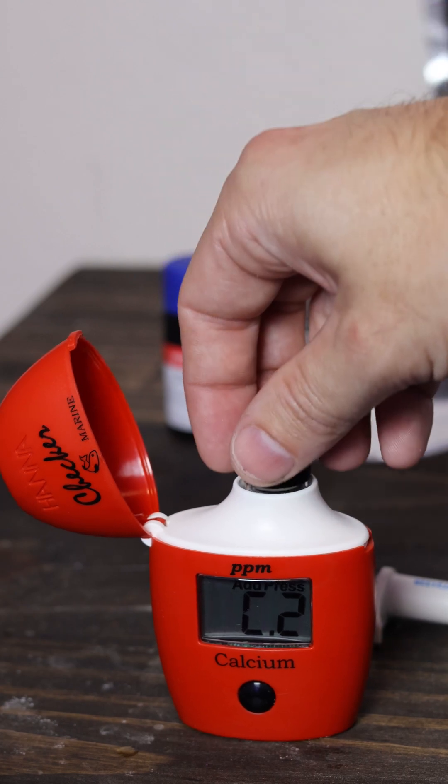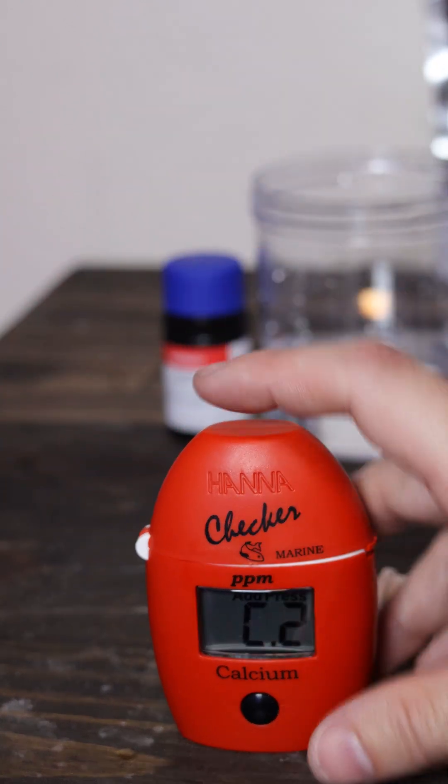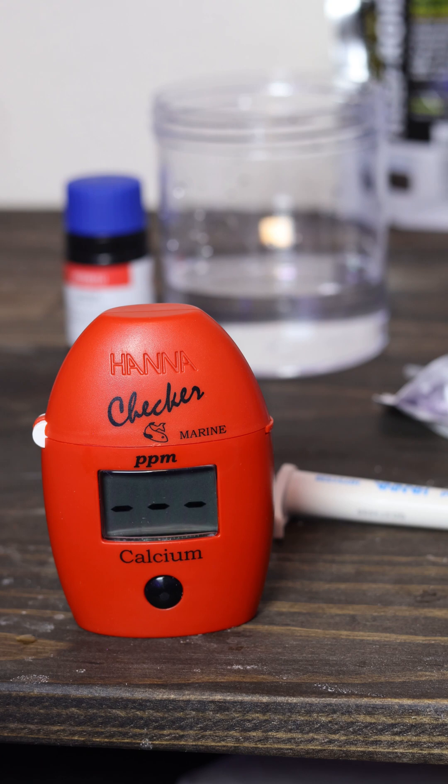Insert the test tube into the Hanna checker the same way that you did before. Press the button and then after a short period of time you should have your reading.